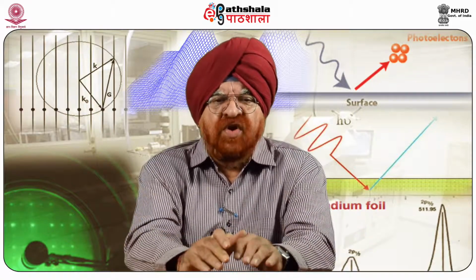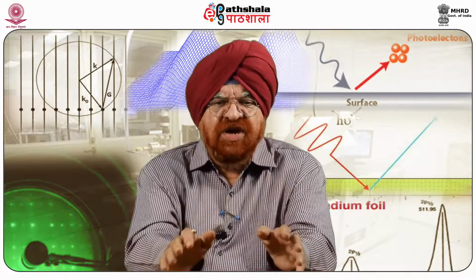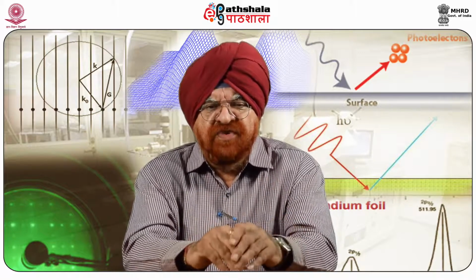Therefore, since the samples showed a flat surface, the magnetic activity of these three films was evaluated by scanning the MFM tips along a 20 micrometer line across the crystalline quartz substrate, partially covered by the desired germanium film.